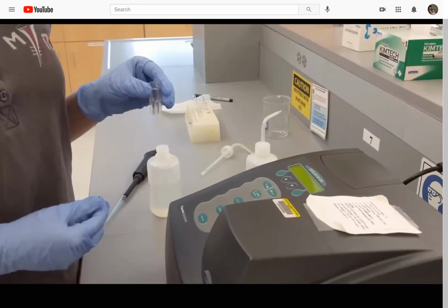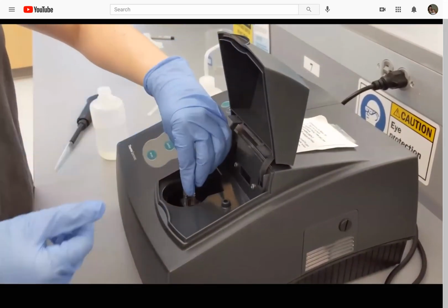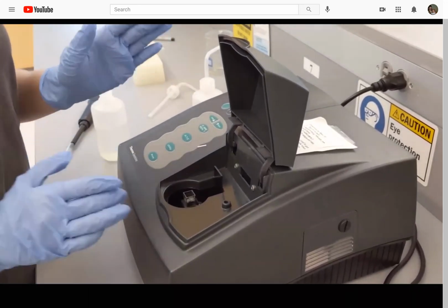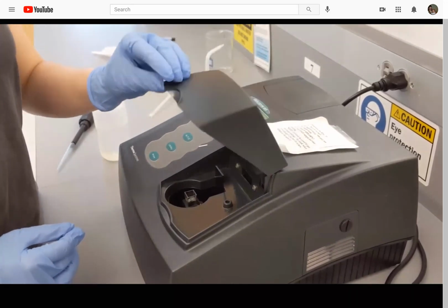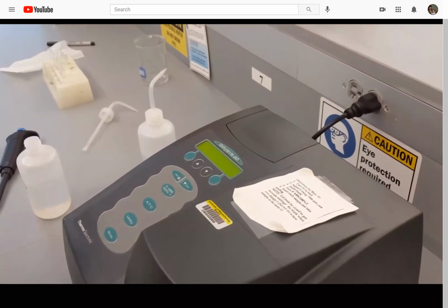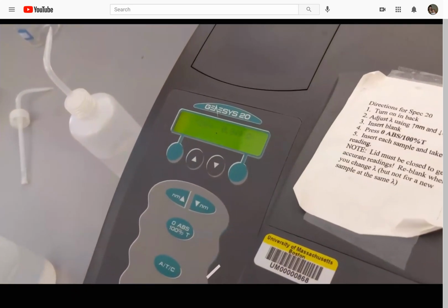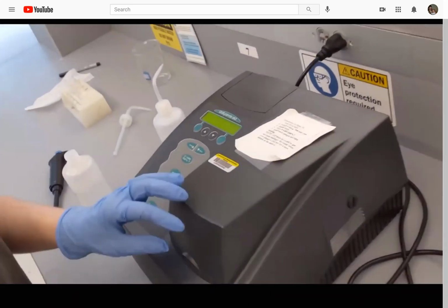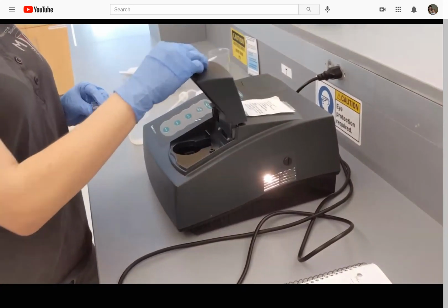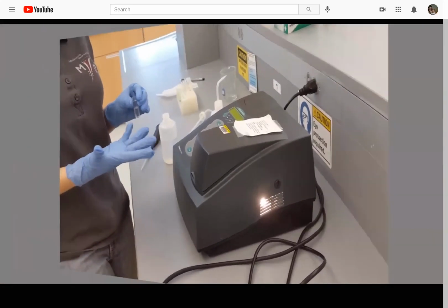So now that we have the cuvette, we can go ahead and take the measurement. I've cleaned it off. I'm going to gently insert it into the spectrophotometer. I'm not going to jam it in there or force it. You will feel where it stops. I'm going to close the lid and write down the measurement seen here. A is for absorbance, so that's at 0.049. I'm now going to take this measurement 10 times to determine how well our spectrophotometer is operating.